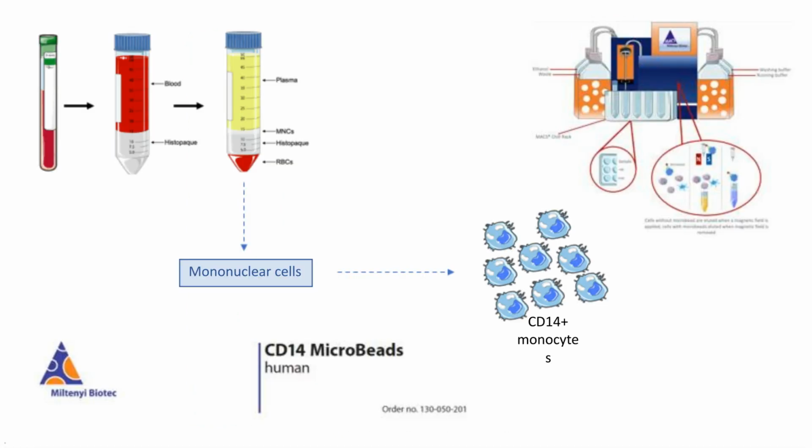So that's thinking about our whole blood approach. Now we're thinking about our mononuclear cells, and we're taking them through using our CD14 microbeads that Salva introduced you to, using the methods he introduced you to, and positively selecting our CD14 positive monocytes, and we get nice purity. We would run at about a 92 to 95% purity of the cells most days in my laboratory. And so we can use these for a whole host of downstream analyses, and I'm just going to walk you through a few examples of those different types of approaches that we take.